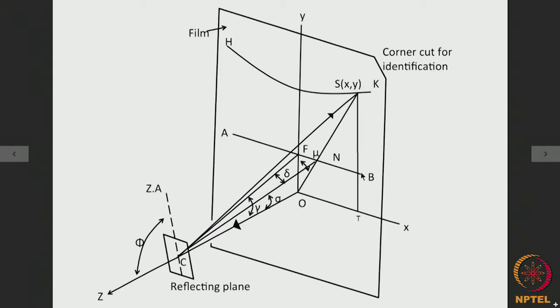For another zone we will have another particular hyperbola for the diffraction spots and another particular line for the plane normals. So, from this diagram, we see that the gamma and delta values for a particular hyperbola will be a single gamma, but deltas will be different.